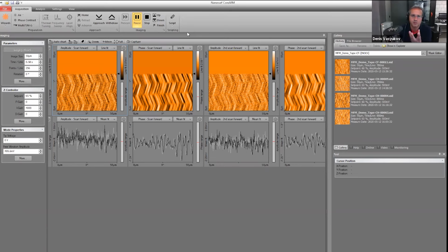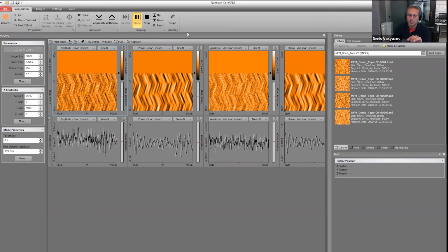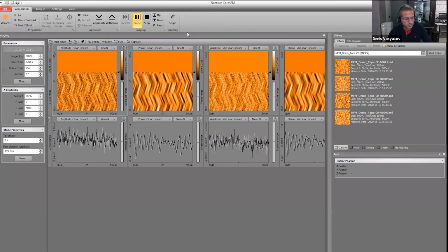Essentially, the rotation of this magnet will define the field in which your sample is submerged. So in principle, with this device, you could measure change of magnetization in a parallel external magnetic field. The vertical magnetic field we still don't have, but hopefully we'll have it in the future.